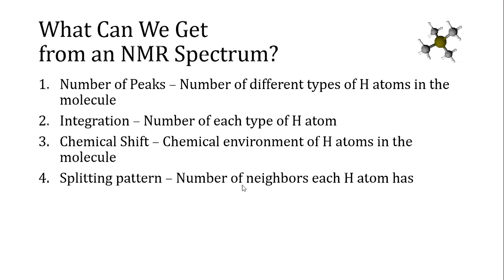There's a little bit more to be said about the number of peaks and the splitting pattern than will be covered in this video. It will be covered in an upcoming video on complex splitting.